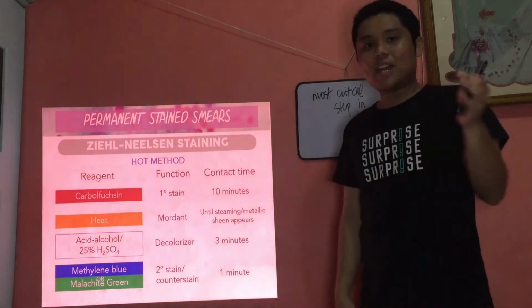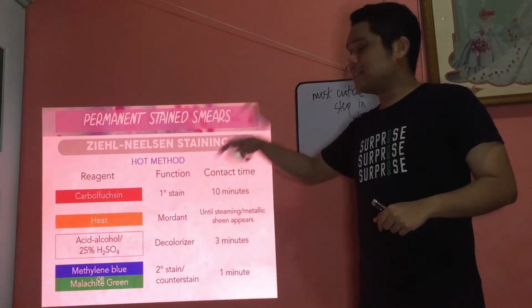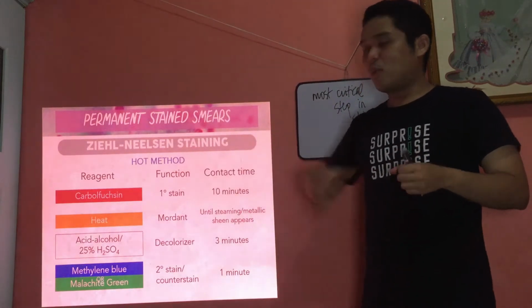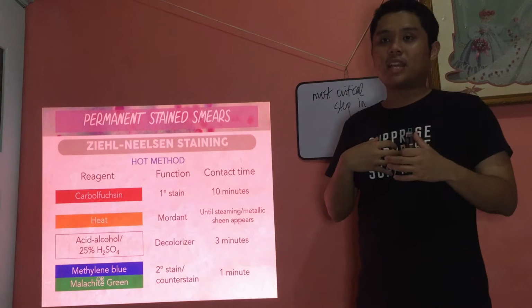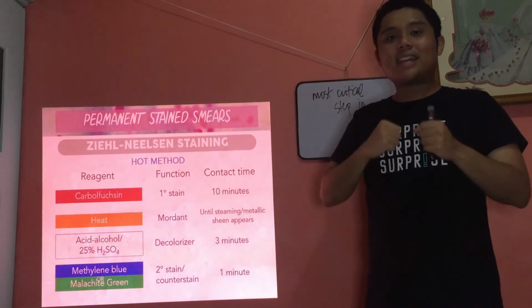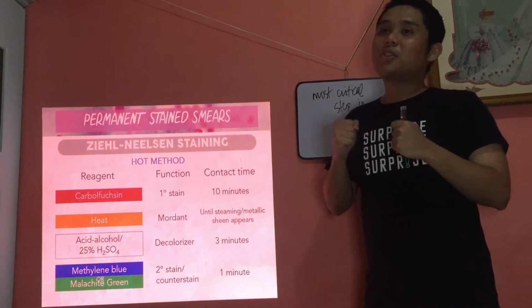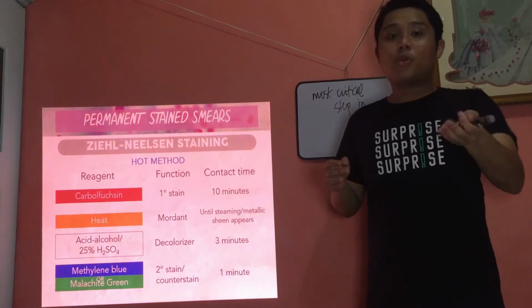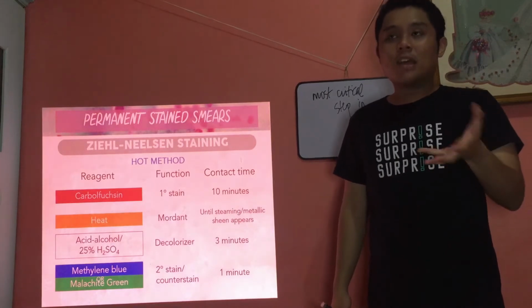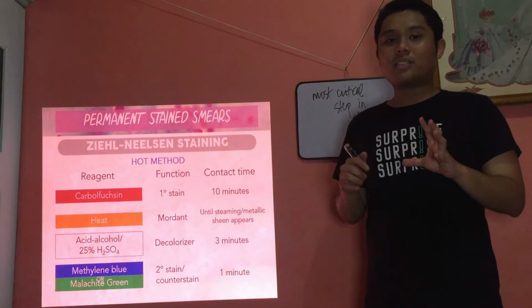On the other hand, if there is under-decolorization, where the decolorizing reagent was just little, the organism that is really not able to withstand or hold the carbolfuchsin may still retain it, because it was not that tested. So it will lead to false positive results. That's why it's considered to be the critical step in gram staining or acid-fast staining. I hope the point about the decolorizer is clear.